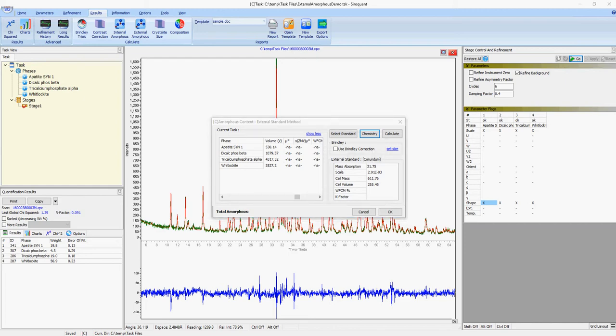Or, if you already know the mass absorption coefficient, it can be entered directly into the tables. In this case, we know for this sample it is 84.91.